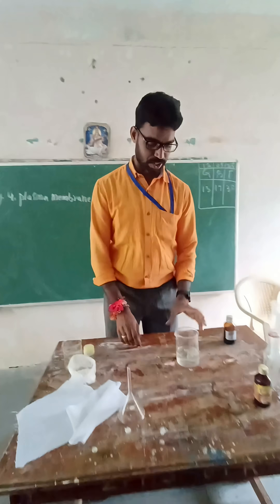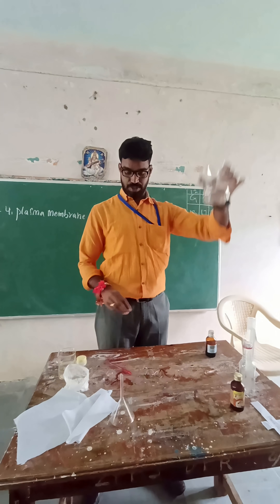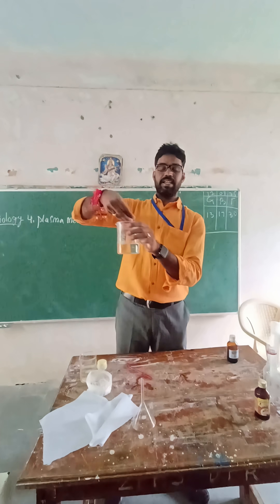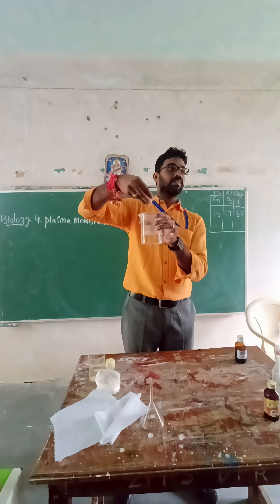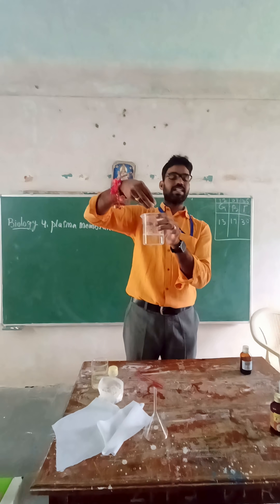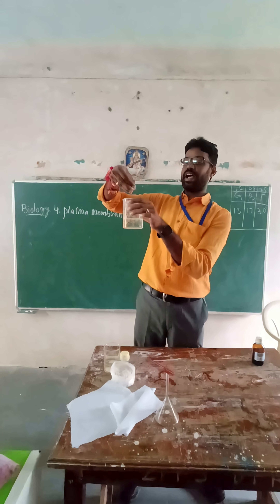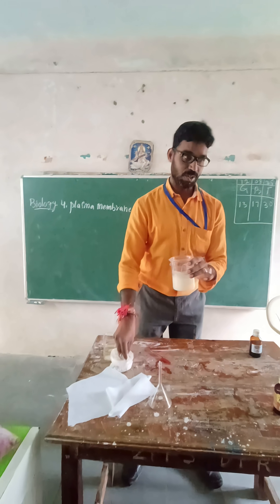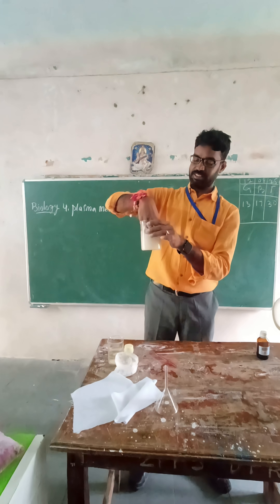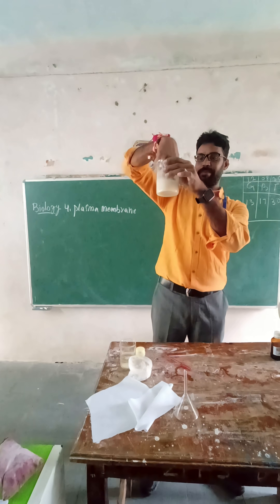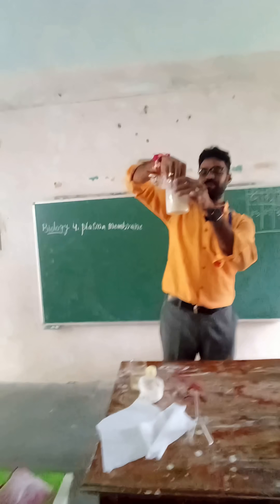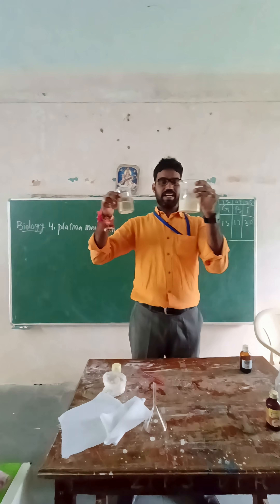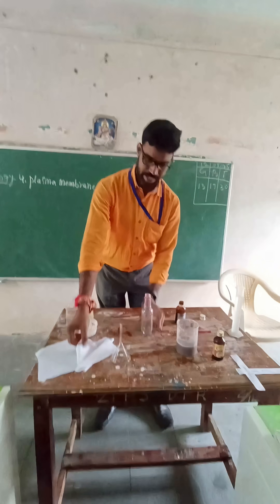The next solution we prepare is a flour solution. We take some flour and mix it into water — flour is the solute and water is the solvent. So we now have two solutions ready: the sugar solution and the flour solution.